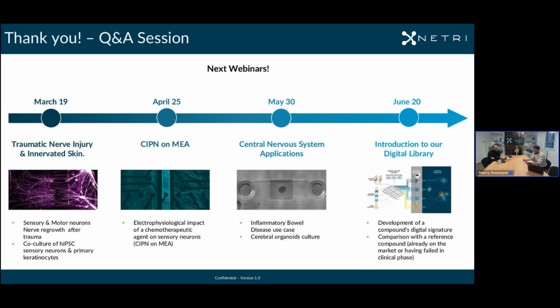Is it possible, and you answered some of it with the supernatant, but let me re-ask the question. Is it, or in some ways differently, is it possible to perform RNA sequencing with this organ-on-chip? And is sampling supernatant for this not a limit of the device?